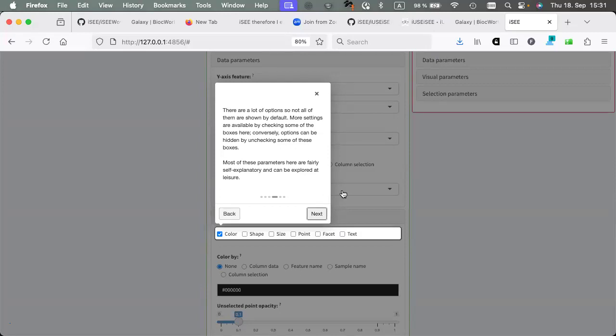And also at the same time, we didn't want to chug whatever Shiny server for running something in a reactive way, where whenever you change something you possibly kill the resources that you have available. You shouldn't do that.